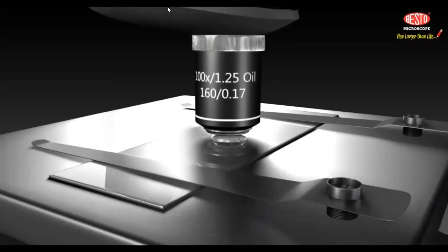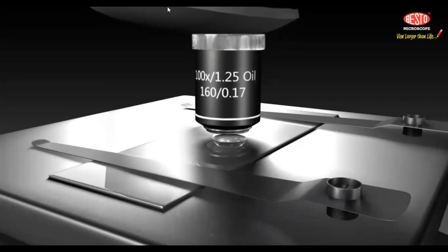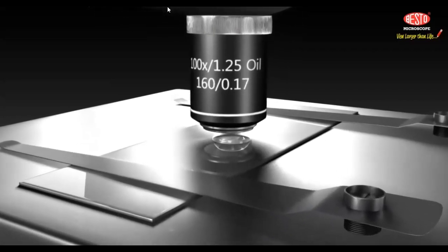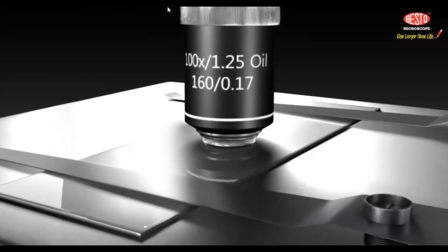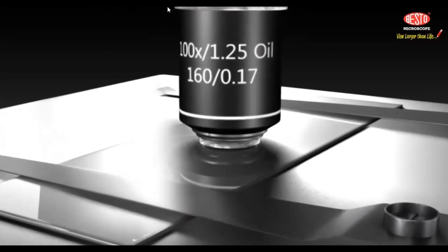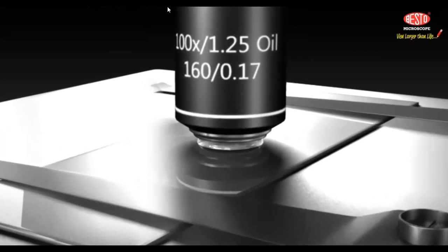Step 11. Medical microscope model Besto 10 has a special type of lens called an oil immersion lens, 100x. This lens is used by placing a drop of cedarwood oil on the top of the cover slip and adjusting the position of the front lens of the objective so that it is touching the oil drop.